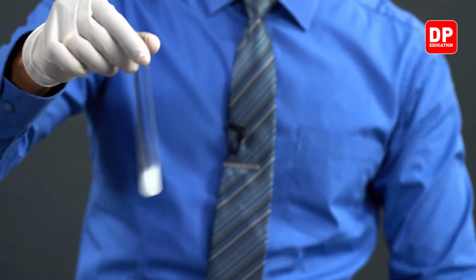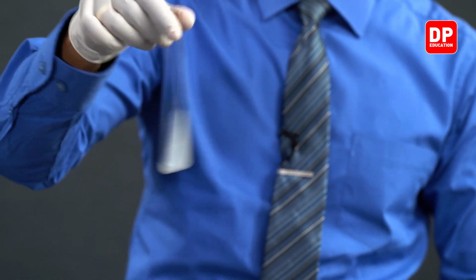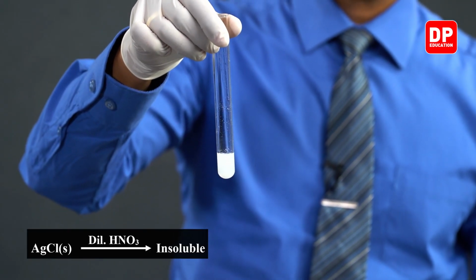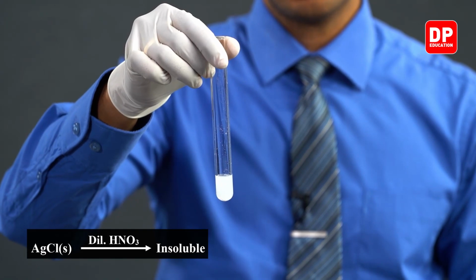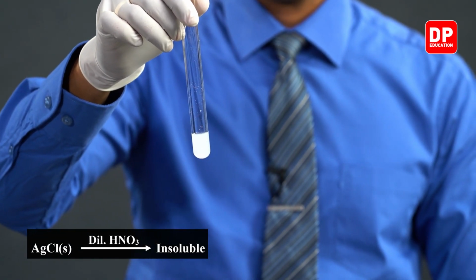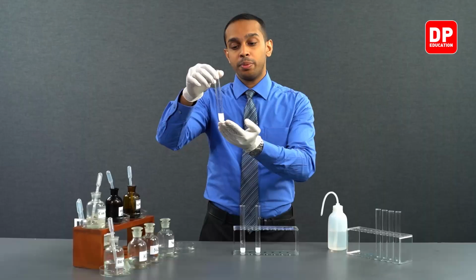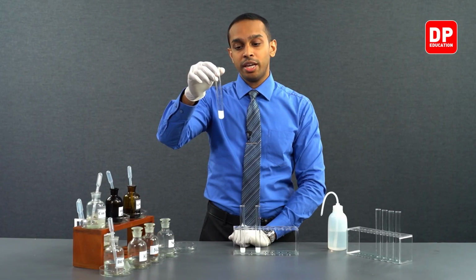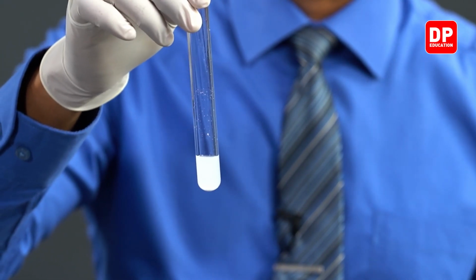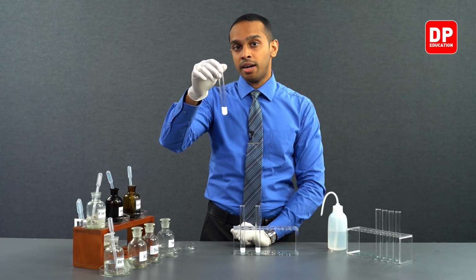We'll give it a little swirl. As you can see, addition of nitric acid to silver chloride solid did nothing. It did not bring about any chemical change because silver chloride does not dissolve in nitric acid.